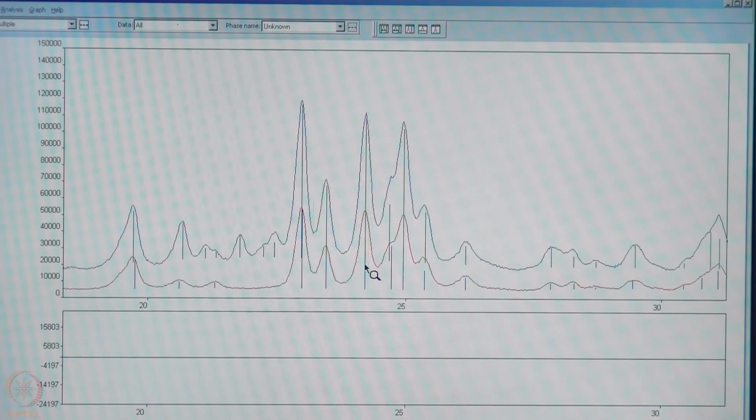that if we have forgotten to put the K beta filter, that is the nickel filter for copper radiation, we will get additional peaks. And if we treat these peaks without knowing that they are from K beta, any indexing software will fail to index this powder pattern. So the presence of a K beta filter in all diffractometers is essential, and we must not forget to put that.